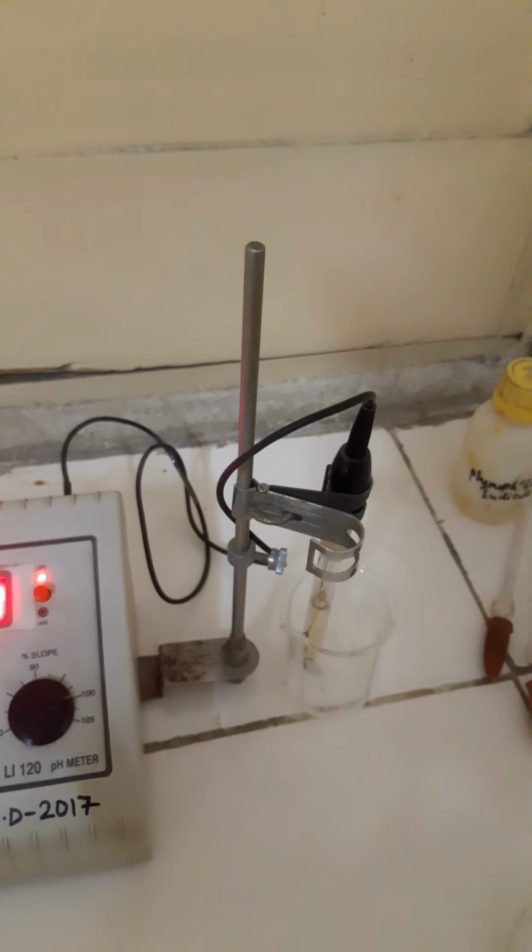Now we have to add 0.25 normality sodium hydroxide by adjusting the stand above this solution. Now we have 75 ml of the glycine, and in this burette we have to take 0.25 normality sodium hydroxide, and you start adding 1 ml. You have to add 1 ml and stir it with a glass rod.